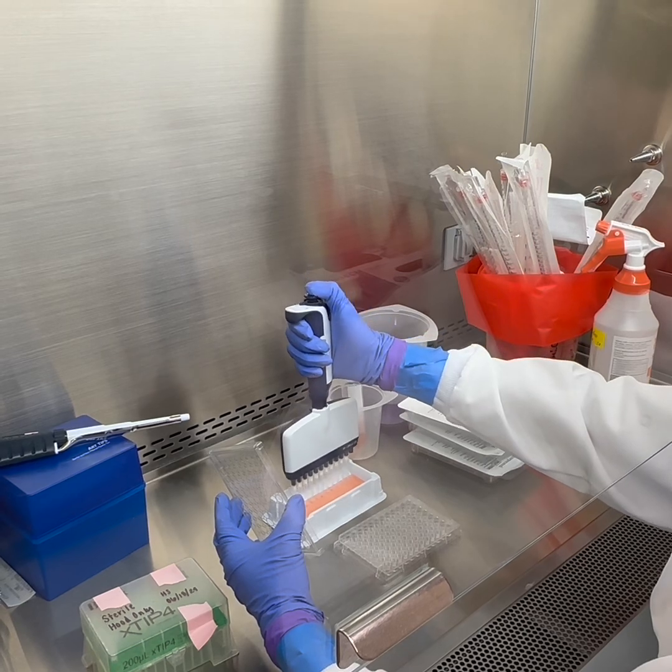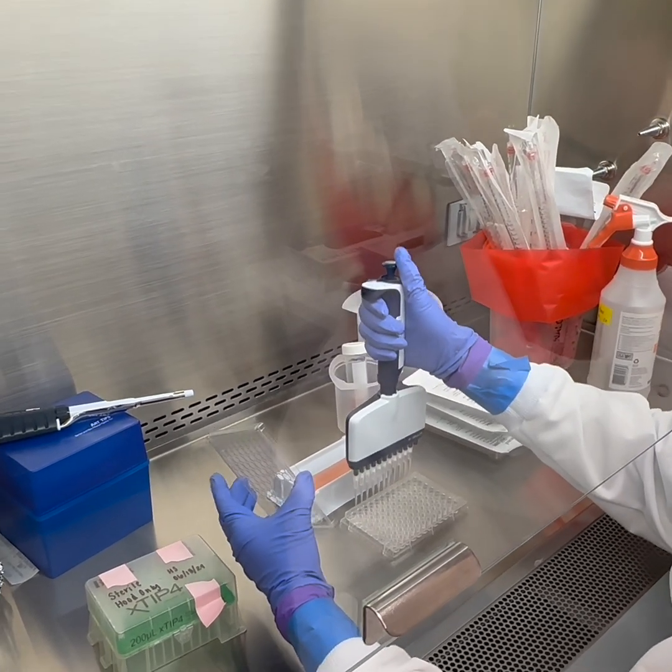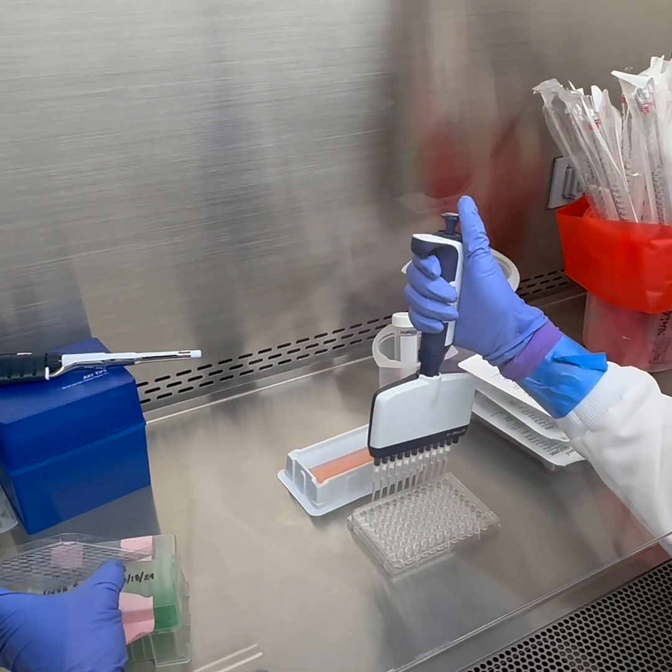Make sure when you pipette that it's level across all of them. And then you can set the lid down.